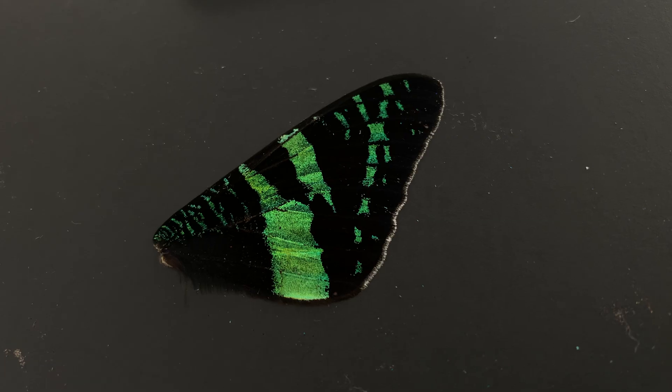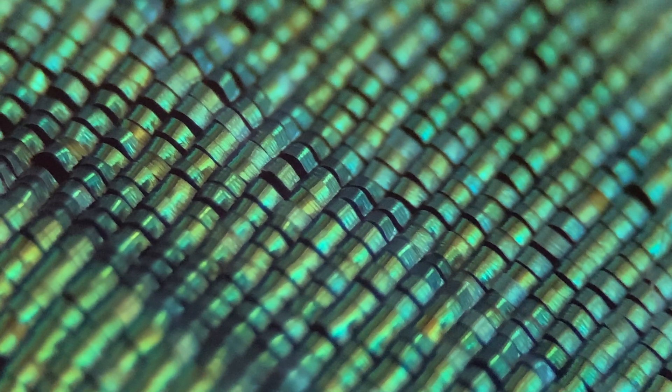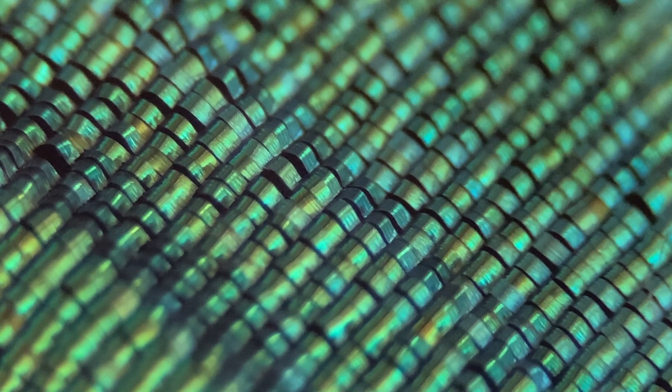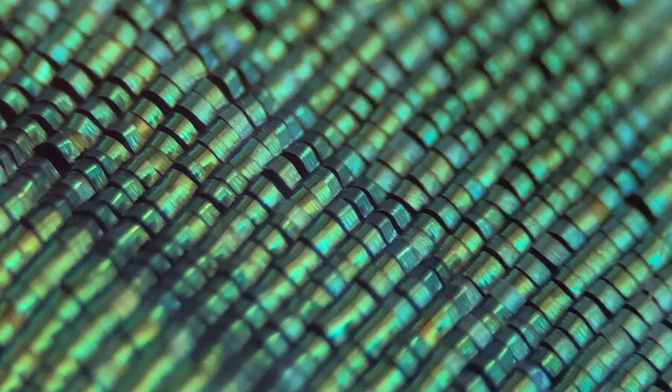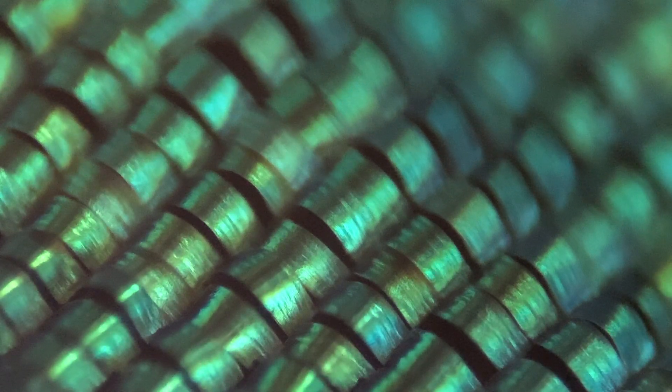Alright, this has been some pretty good footage of the housefly wing. But let's go ahead and take a look at some butterfly wings. I've got this nice green one here — this is about 40 times magnification. And we're going to zoom up a little bit to about 100 times. It's really cool to see how they're all kind of folded into each other.